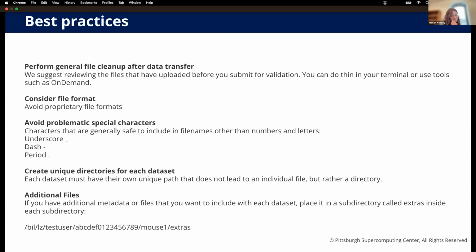Yeah, Katie. Hi. So I want to apologize for uploading 300 terabytes of proprietary image format data. While we're here, it's okay. I was asked to do it, and the alternative is convert. We have processed output data, right? So I guess I had a couple of questions. One, you said processed data should be a separate submission from raw data. That is true, yes.